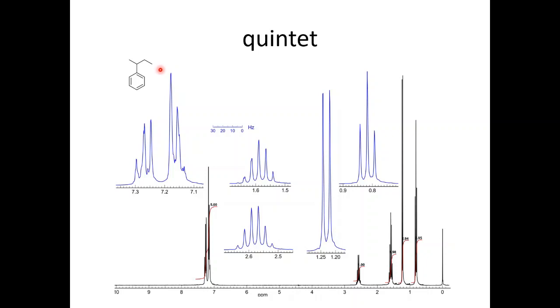These two peaks are clear. The three protons of this group and one proton of this one have similar J values. Remember, if they have similar J values, then the n+1 rule is applied. So one hydrogen of this group and three hydrogens of this one — four total — means this CH2 is split into a quintet of five lines.